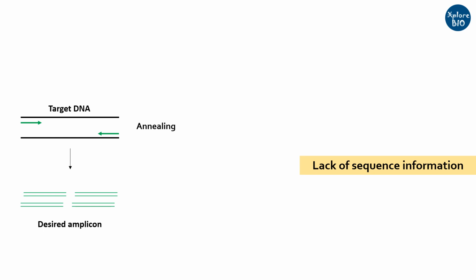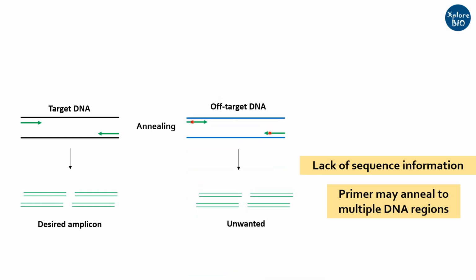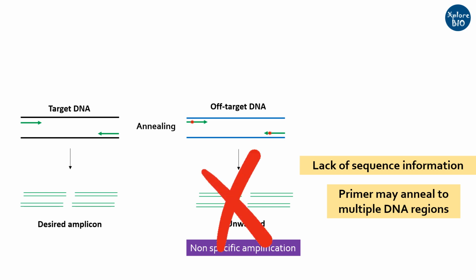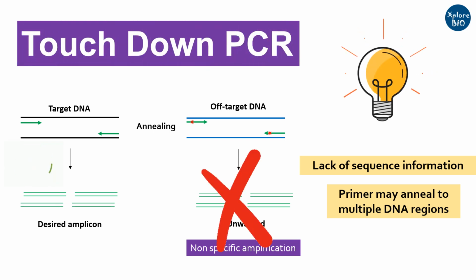Moreover, at times, even when you use 100% complementary primers, your primer may bind to multiple sites on DNA and may produce multiple amplifications, some of which are of your target and some are from undesired regions. One of the effective ways through which you can reduce the chances of non-specific amplification and allow only the specific target to amplify is by performing touchdown PCR. But before this, let's briefly see the basic steps involved in standard PCR amplification.